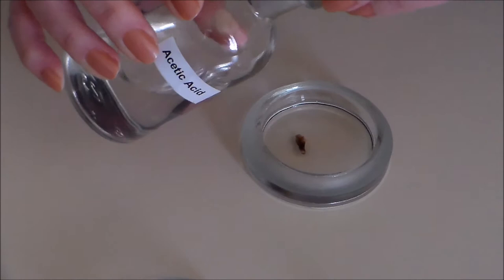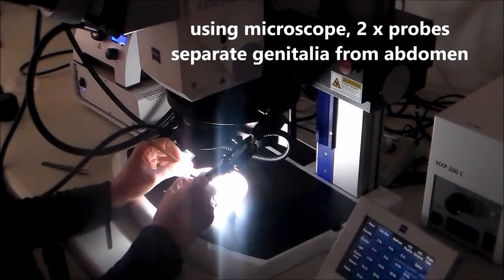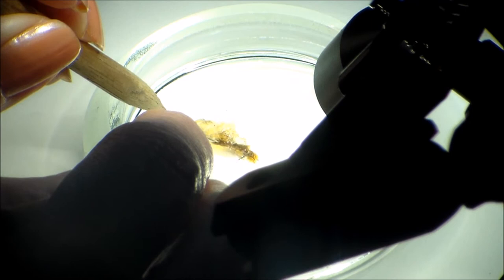The Biosystematics Division of the ARC uses a state-of-the-art high-resolution microimaging system for dissections. Using 2 tweezers or needle probes, gently press the end of the abdomen towards the apex and push out the genitalia. Separate the valves from the abdomen by gently pulling them apart.